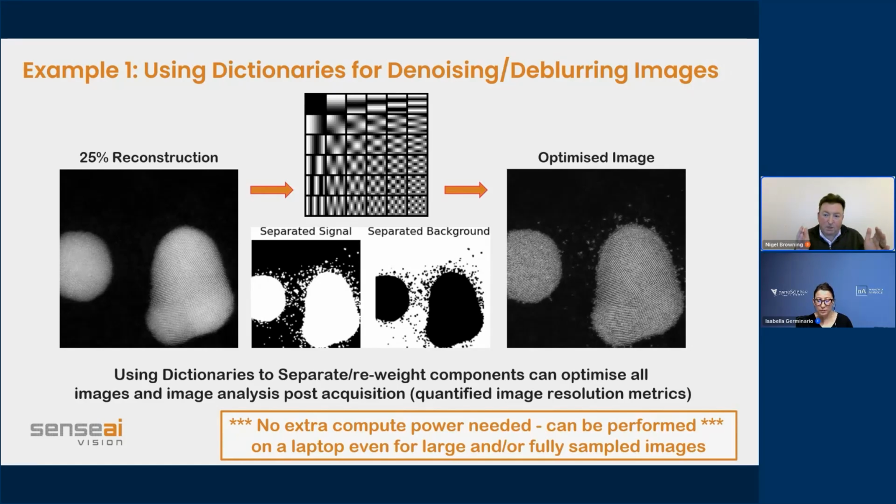We know from the live image that we're at the optimal focus. And then afterwards, we can go ahead and reconstruct to get the optimal image. The live image lets us get the optimum conditions. The post-acquisition doesn't need training data because we know that our acquisition is already at the optimal point. We can go ahead and reconstruct using our dictionary elements. And that can apply to any image. And we could go through and apply it to any image that's acquired.